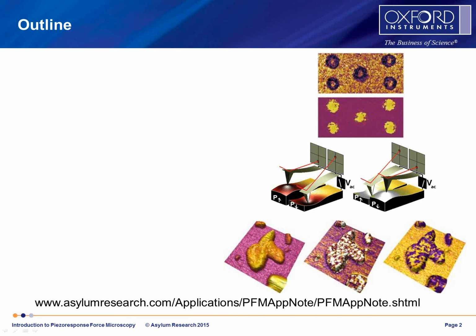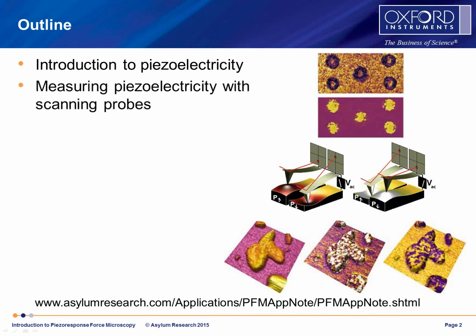The way it'll play out today is that Sergey Kalinin will give us an introduction to piezoelectricity. He'll talk specifically about measuring piezoelectricity with scanning probe microscopy, AFM, PFM. One of the challenges with PFM is sensitivity. One of the ways to improve your sensitivity is just to turn up the voltage, turn up the volume. So we'll look at higher voltages.